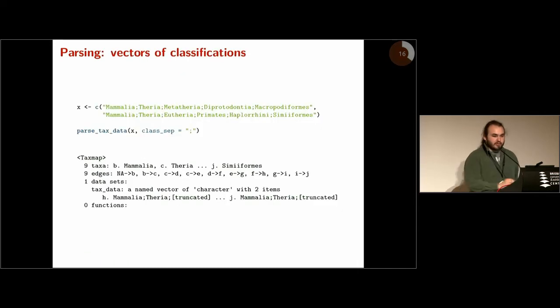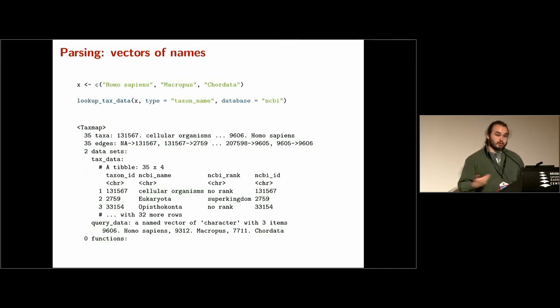I'll show you some examples of how you read in different formats. If you have a vector of classifications, you use parse_tax_data and give it a separator, and it will spit out a taxmap object. It will generate arbitrary IDs because taxa can have the same name - taxa names are not unique. And the original input data is included in the object as one of these user-defined data sets. If you have a vector of names, it will look this information up from a database - in this case we're using NCBI, but you can use other databases. You need an internet connection for this. And you say it's a taxon name. Now we're not using those arbitrary IDs anymore, we're using NCBI's IDs. And other information that was looked up associated with these taxa is added in this tax_data table, and our original input is also here.